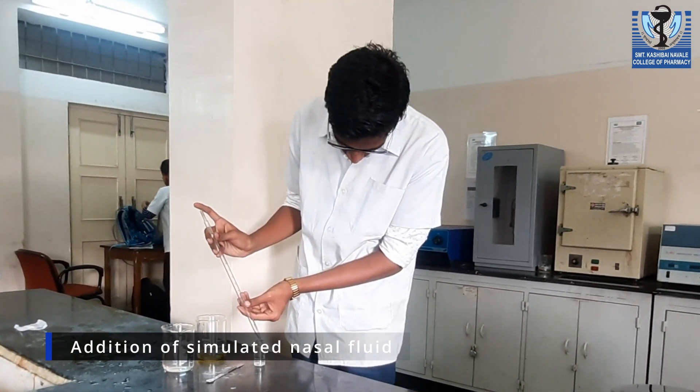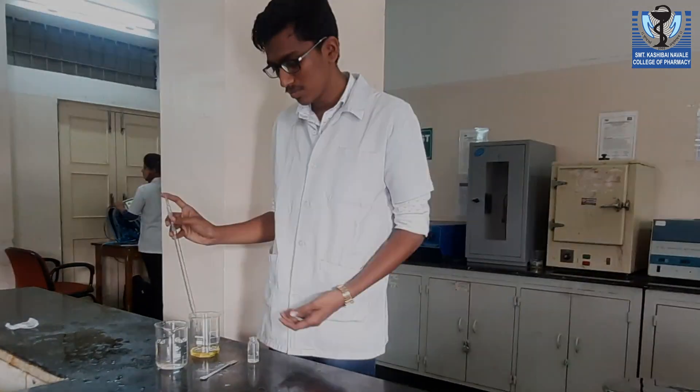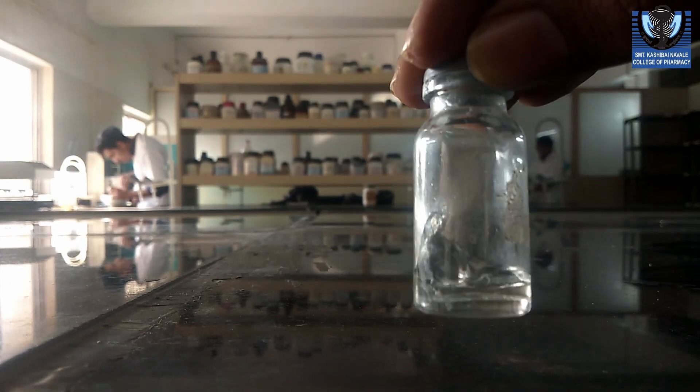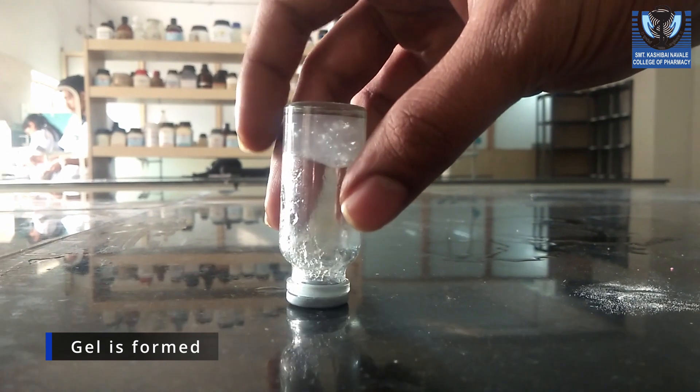In the final formulation, simulated nasal fluid is added to check whether gelation happens or not. The solution is turned into gel after addition of simulated nasal fluid.